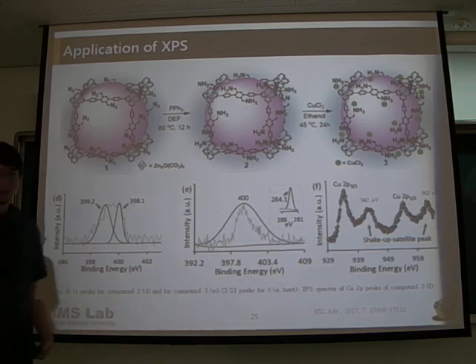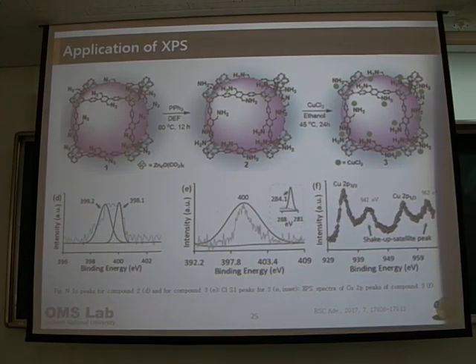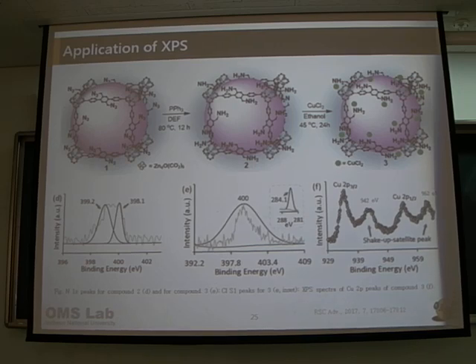Actually, the last part, the retention mass, is the inorganic part. There is no mass degradation there. Retention should increase after incorporation of copper. And above that, degradation may be due to this polymer chain degradation. So thermally, your MOF becomes more stable. That's what you want to say. Yes. And you don't know what. Finally, actually, we want to say the MOF is stable at this temperature, and the final weight percentage should increase.